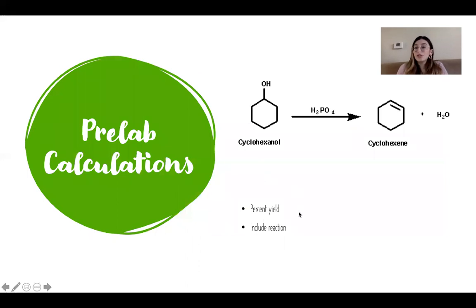Your pre-lab calculations, you need your percent yield, not percent recovery, percent yield, and you need to include the reaction. This right here is our reaction.